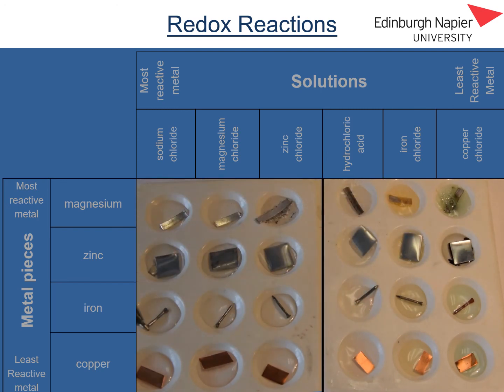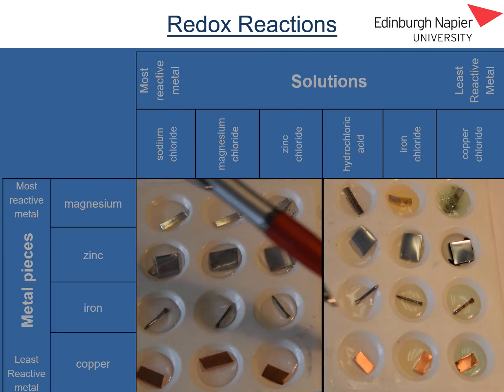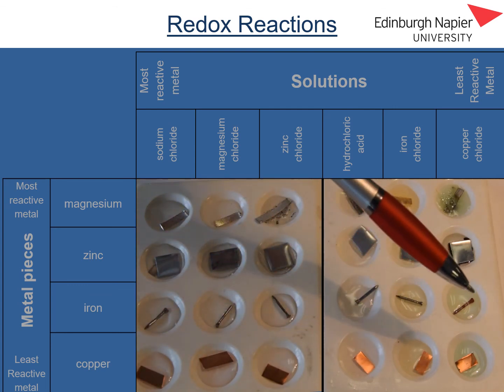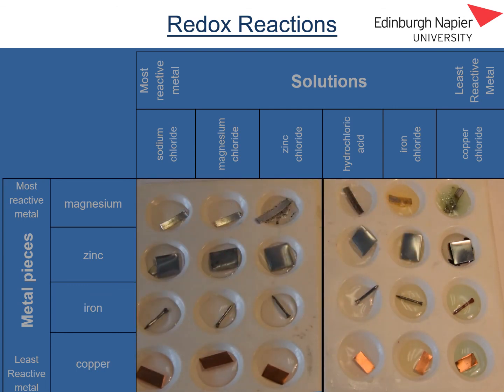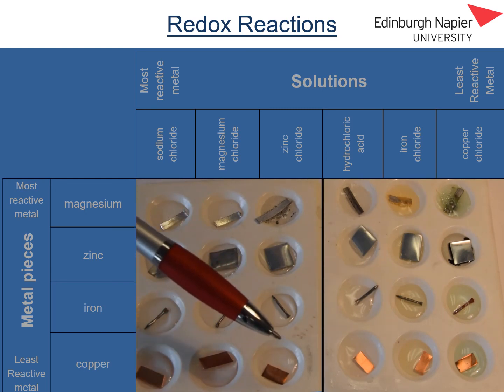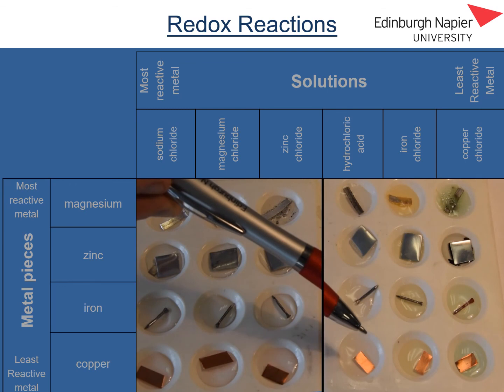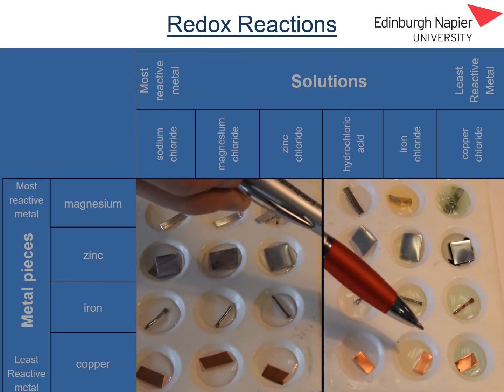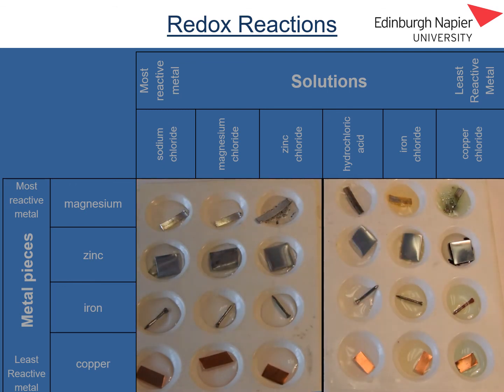In the final row, with copper being added to the various solutions, there has been no reaction taking place in any of those wells. The copper has not reacted with sodium chloride solution, magnesium chloride solution, zinc chloride solution, hydrochloric acid solution, iron chloride solution, or the copper chloride solution.